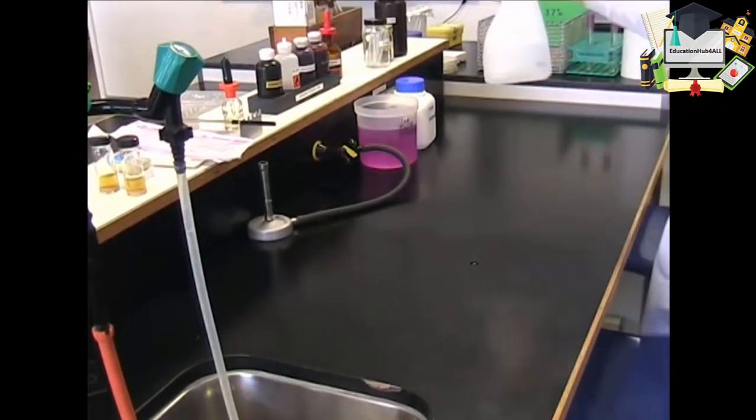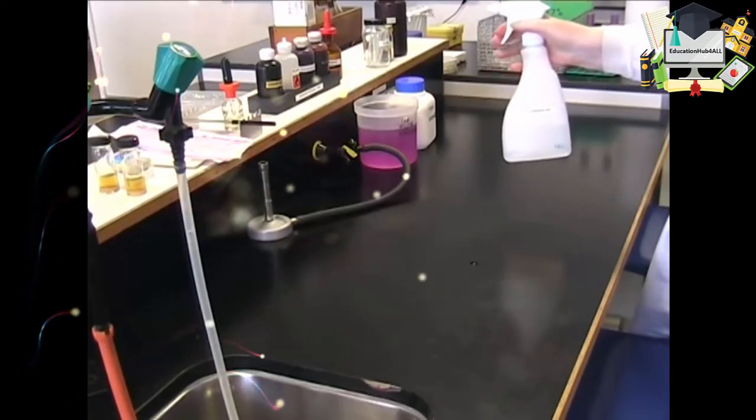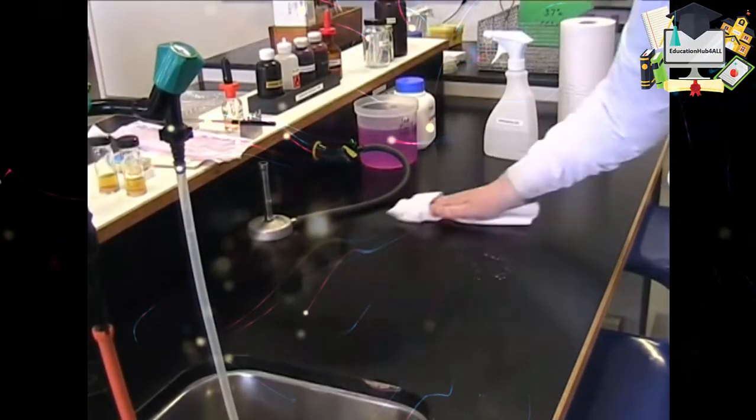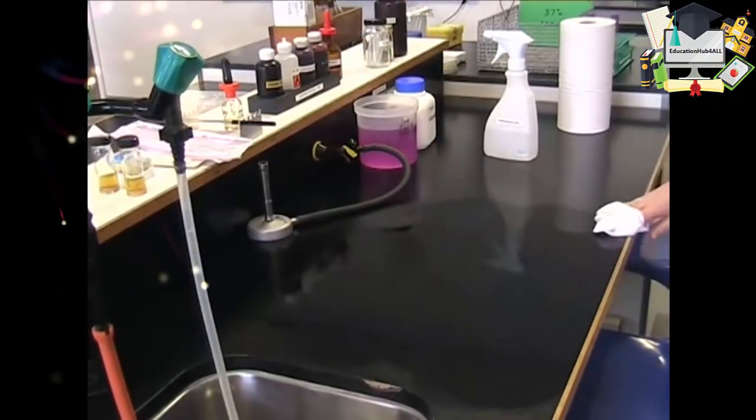We take this solution of Virusol, which is in a trigger spray, and we're going to spray it onto the area. After 5 minutes, just wipe the area down with some paper towel.